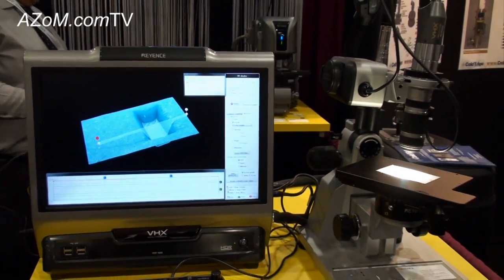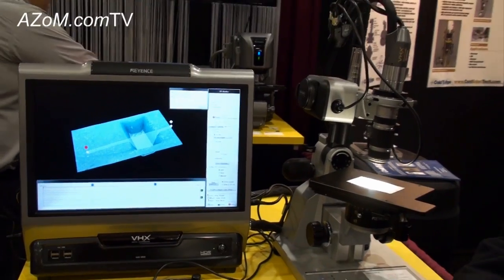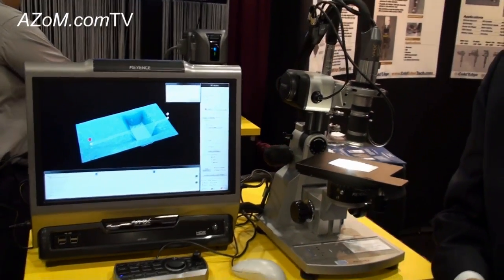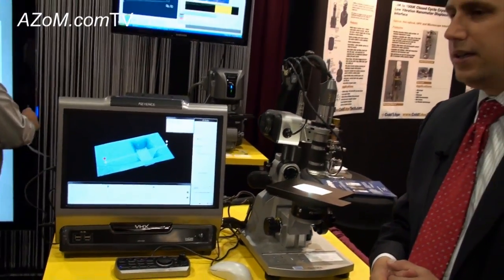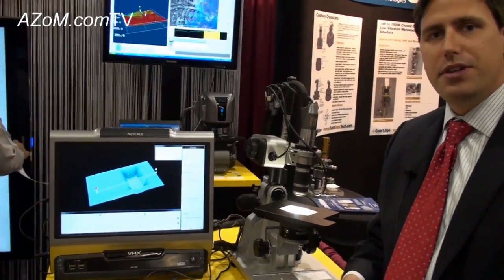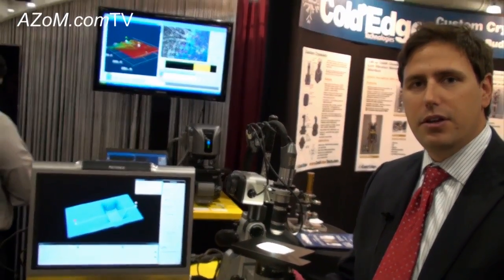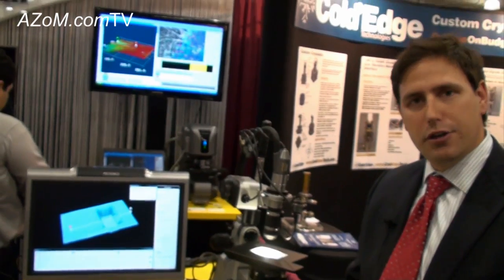We also have the ability to do HDR — high dynamic range — going from 8-bit to 16-bit, so we're able to see very low contrast samples.